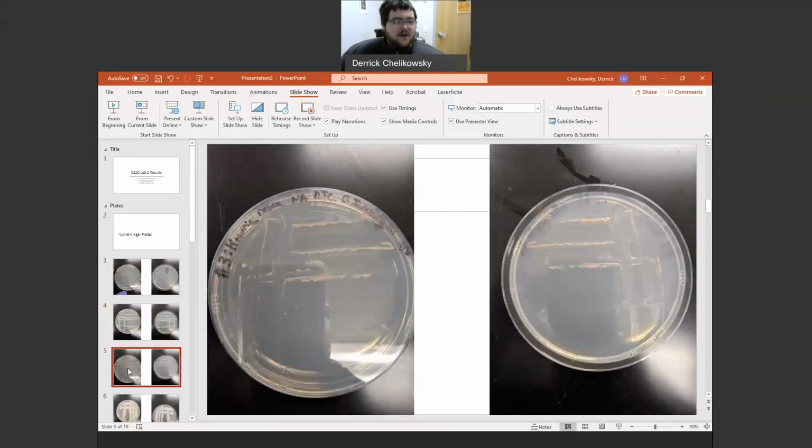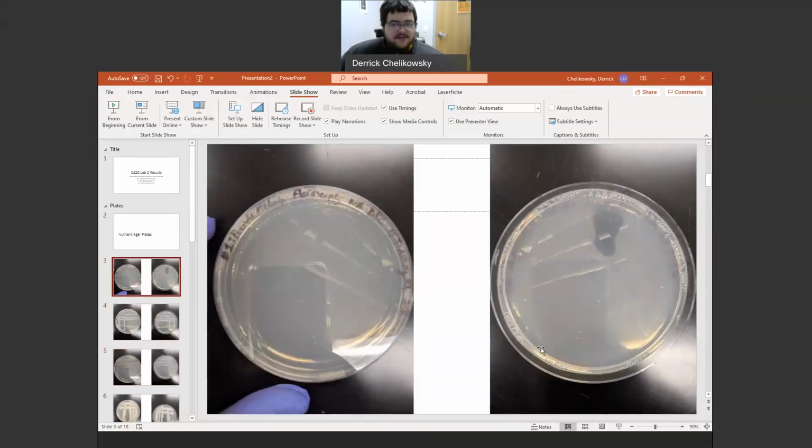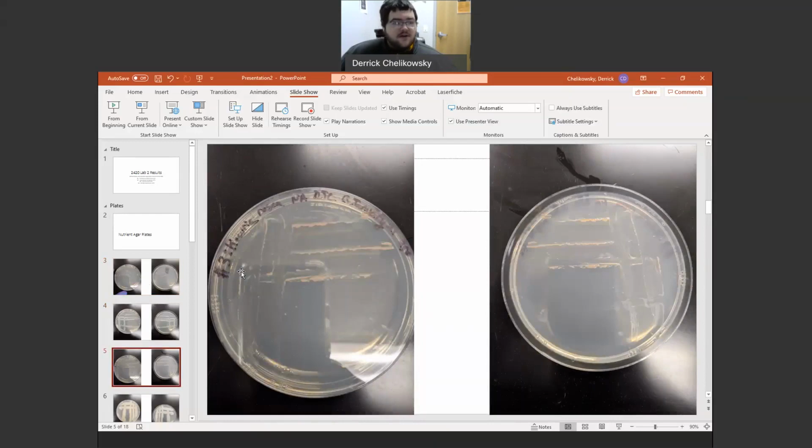The best way to describe it is with the Pseudomonas fluorescens. You're getting some growth here, but not a lot. Now, if we take a look here at the Kocuria, same thing, 3 here, 2, 1. There would be growth over here. Later on in the semester, I'll show you a very good isolation streak. It'll probably be a quad streak. That'll show you exactly what you're looking for, but we don't have those growing at the moment.